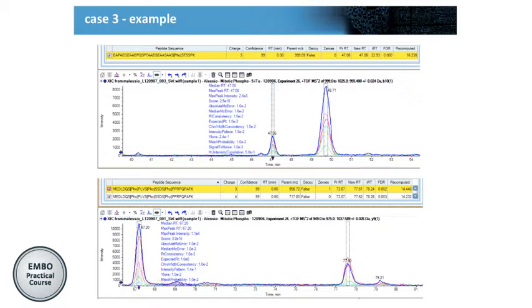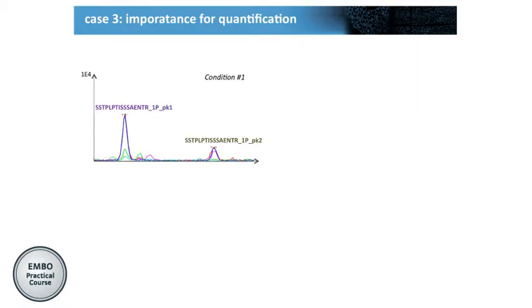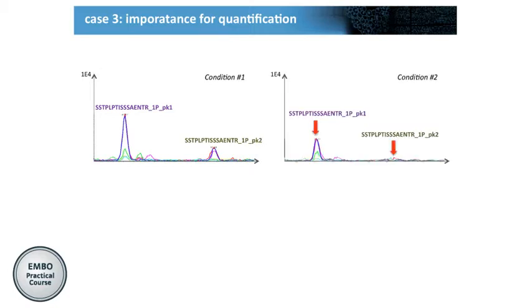So it's not necessarily a disadvantage, because once we handle this situation and are aware of it, we can very consistently quantify each one of these peaks separately. So let's just call this one peak number 1 and call this one peak number 2. And they belong to the same phosphopeptide, but they have 1 phosphorylation somewhere along the site. And in this condition, they would look like this, and we would follow them very consistently across time.